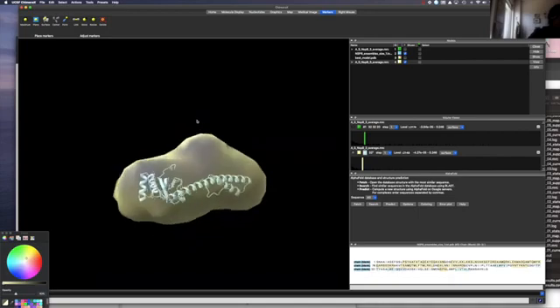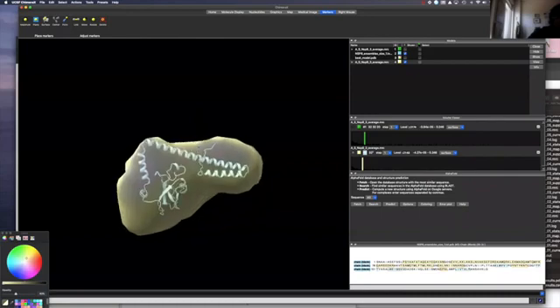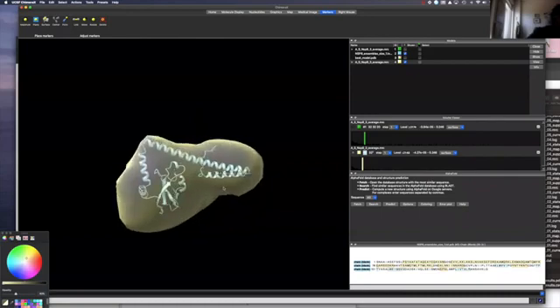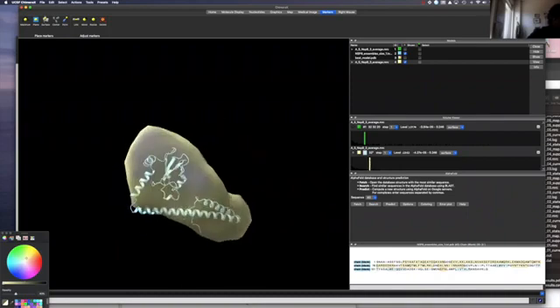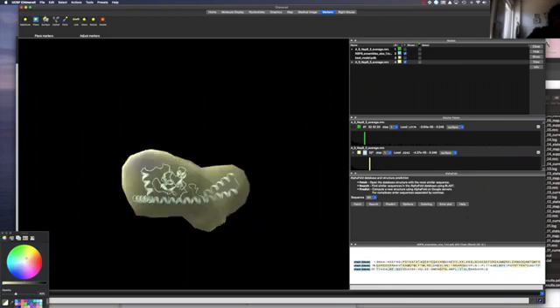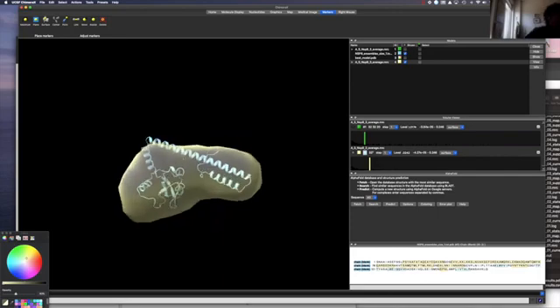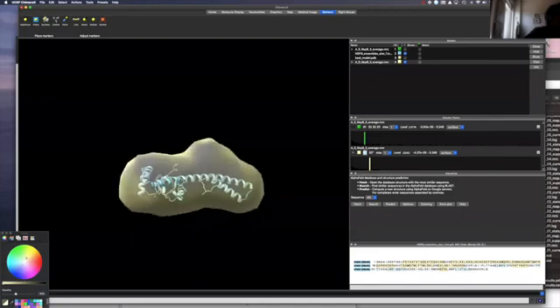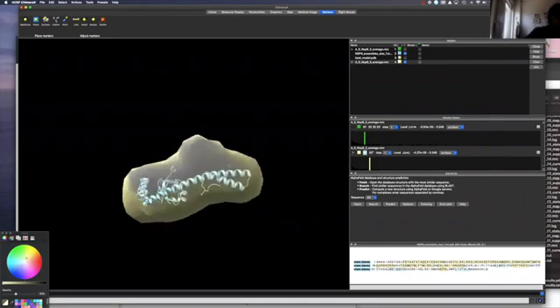This is a very fast 5 runs of DAMMIF, which will definitely improve if you do them in slow mode and do at least 10 models. Then you can get a better agreement with this folded back NSP8 structure. On top of it, as I already mentioned, there is a problem because you have a molecular weight that's a little bit higher, so it's not only monomeric states. So why are we not matching these blobs here? Because there is some contribution of the dimeric state.